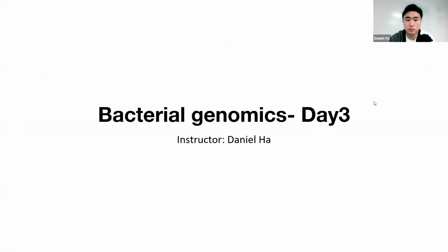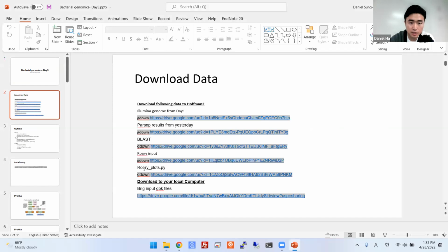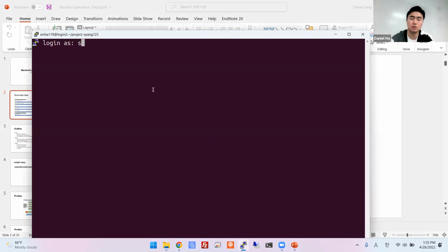All right, guys. So welcome to day 3 of the workshop. Same as yesterday, we just need to download these files to the Hoffman2 before we begin. So let's go ahead and get connected to the Hoffman2.